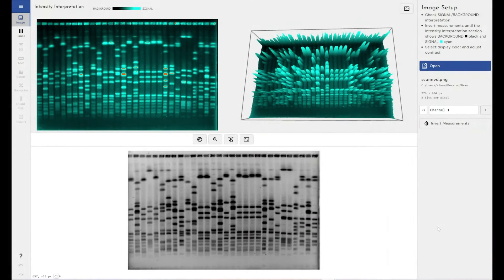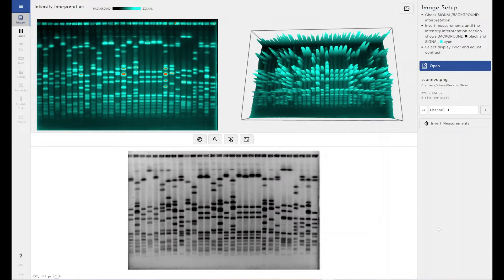So first I'm going to show you exactly how quickly we can make your analysis by using our automated features built into Phoretix 1D.